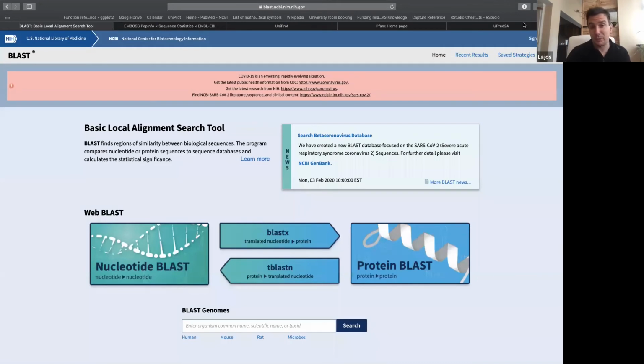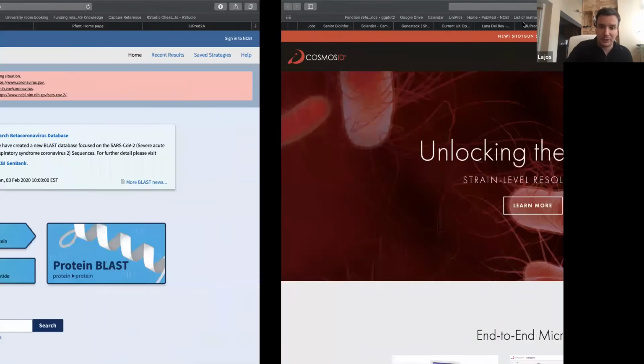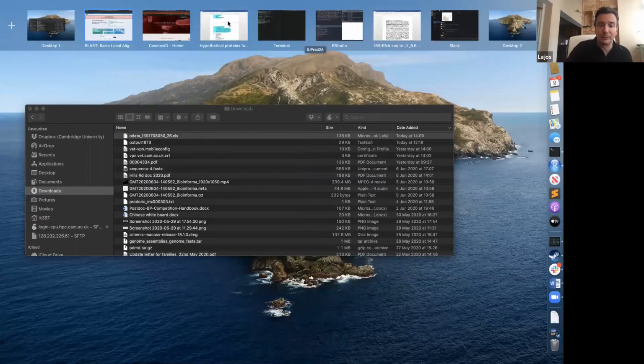Actually, there are many more tools, to be honest, for eukaryotic proteins, but we will remain with the prokaryotic genes and proteins today. So you have your new genome sequence. You are annotating with Prokka, and then you just see quite a lot of records with the so-called hypothetical protein. I will show you how it looks, because thanks to Ibrahim, I have a few.